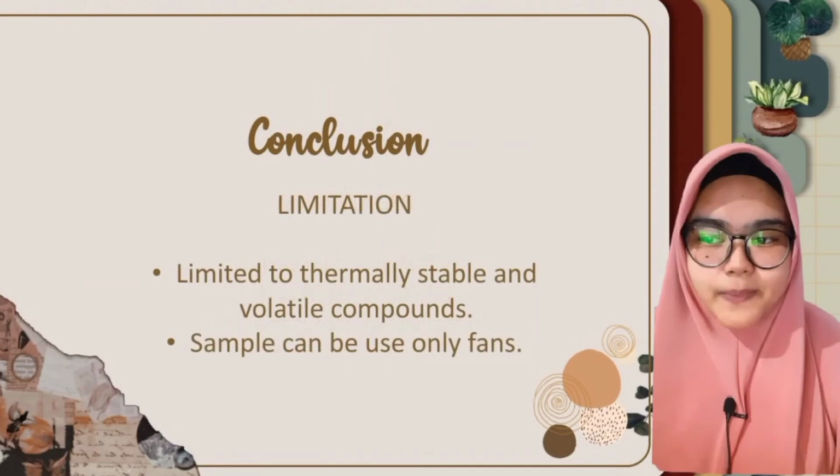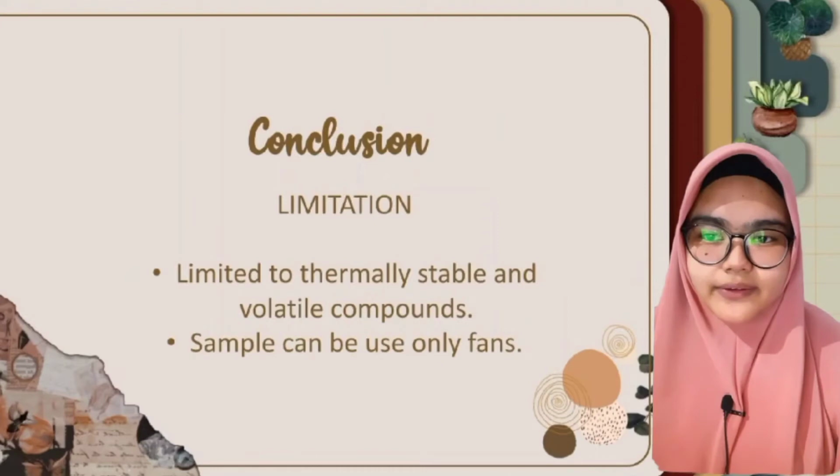The limitation of using gas chromatography is that it is very limited to thermally stable and volatile compounds, otherwise the result of the gas chromatography is not accurate. Lastly, the separated components can be used only once.